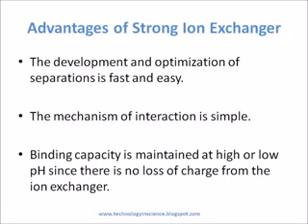Advantages of strong ion exchangers. The development and optimization of separations is fast and easy since the charge characteristics of the medium do not change with pH. The mechanism of interaction is simple since there are no intermediate forms of charge interaction. Binding capacity is maintained at high or low pH since there is no loss of charge from the ion exchanger.